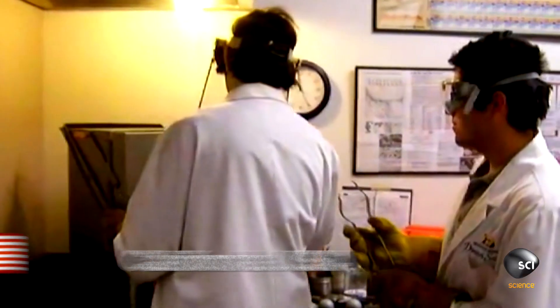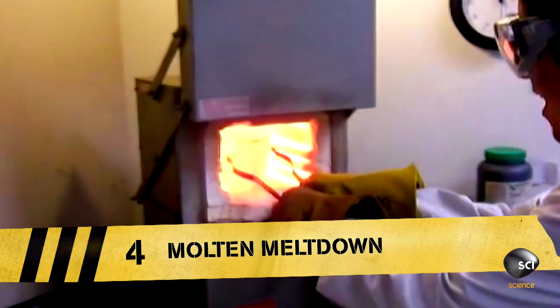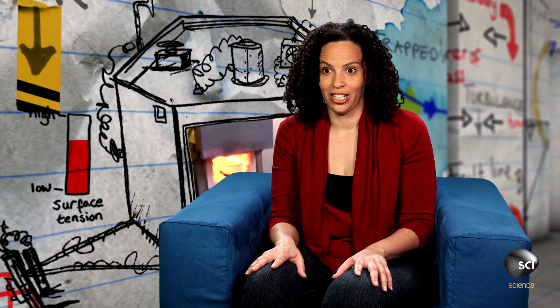At number four in our countdown, two young chemists are experimenting with molten metal. What could possibly go wrong? I think everyone should be wearing safety glasses just to watch this video.